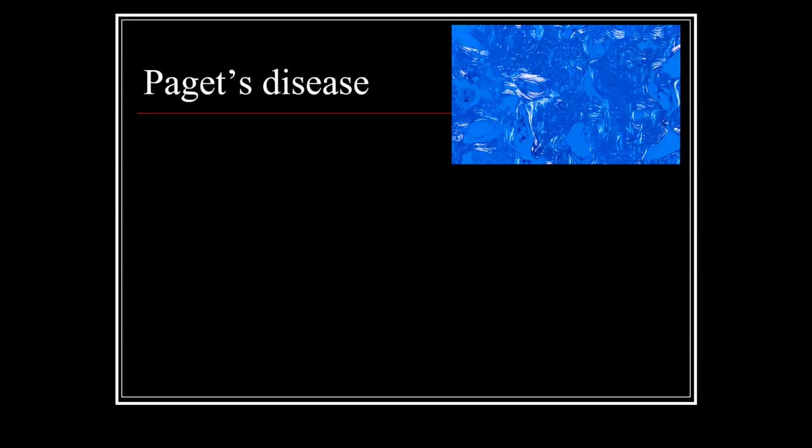Now, Paget's disease of bone has sometimes been called matrix madness. And you'll see here in this polarized light photomicrograph, the normal lamellar bone here around a haversian canal. But you can see the intervening bone is just sort of this bizarre, multiple different layers, different directions of this bony matrix that has been laid down, remodeled, and so forth, indicating that it's just not organized in the usual sense of the way that the bone should appear.